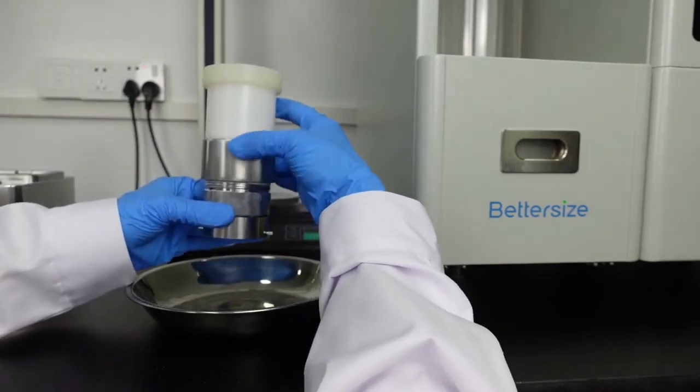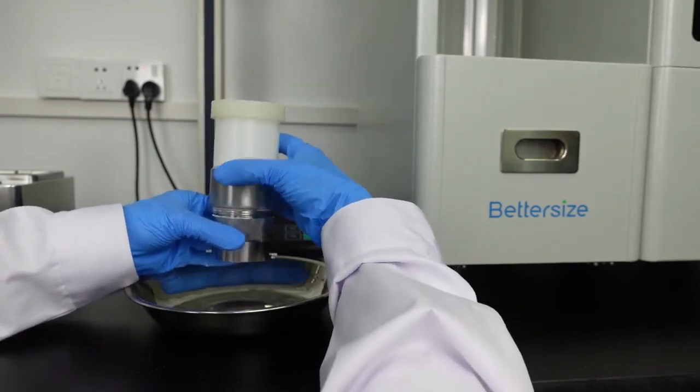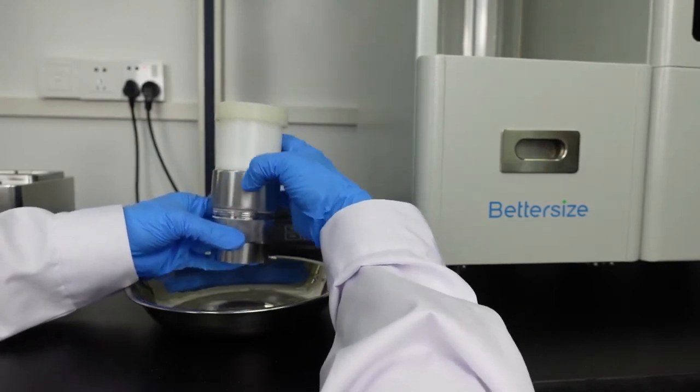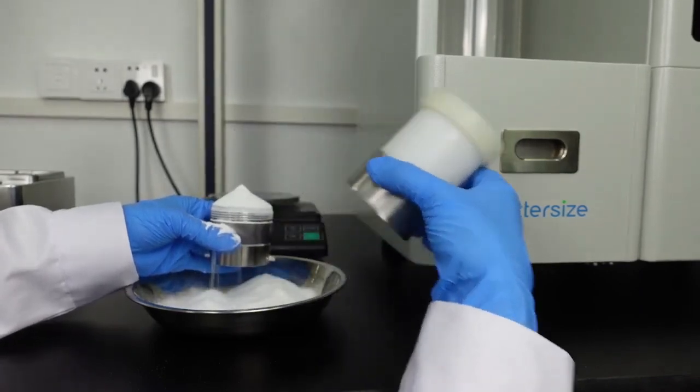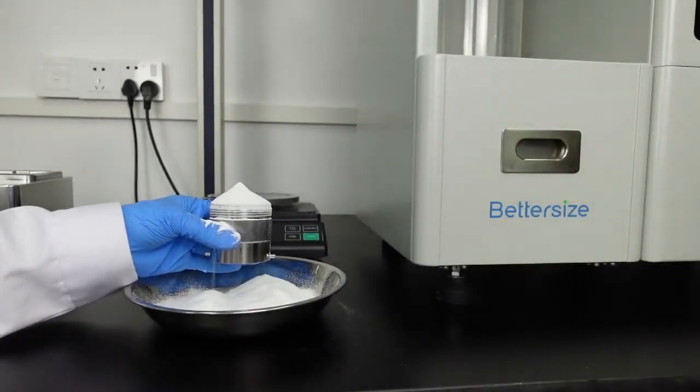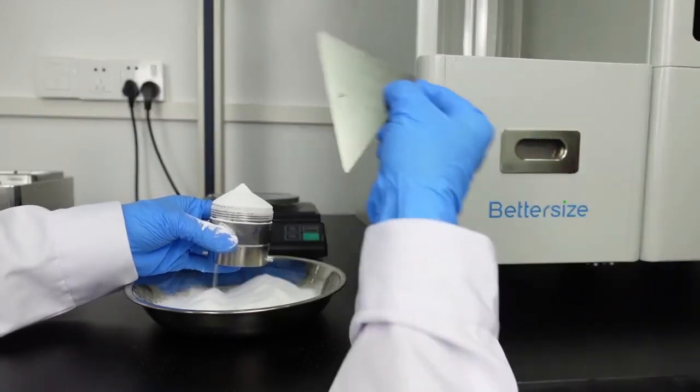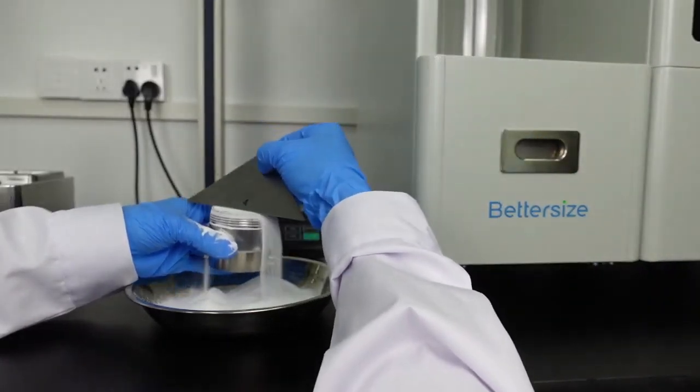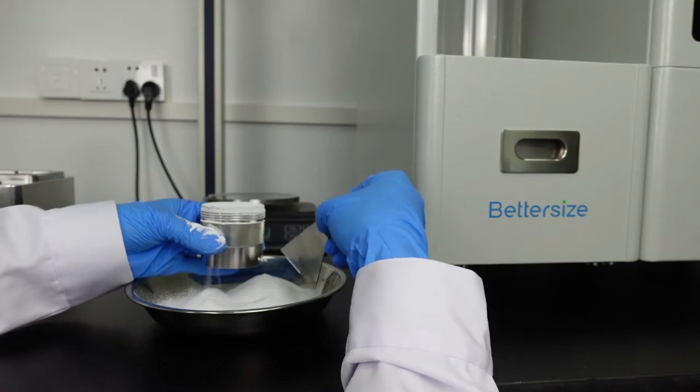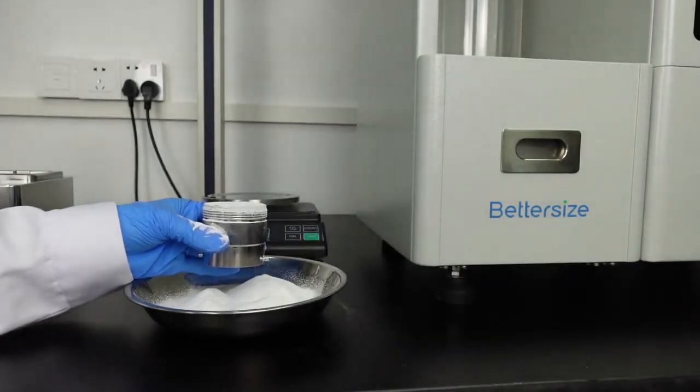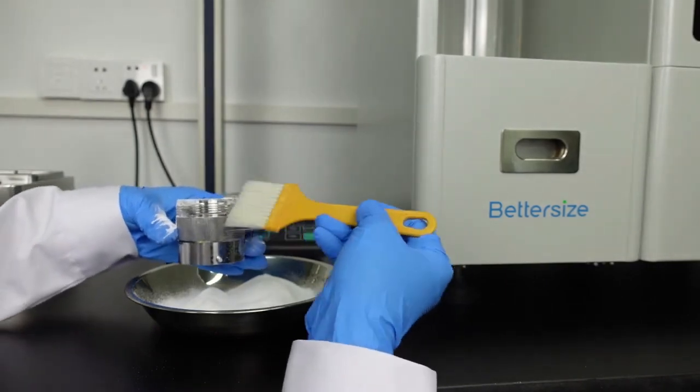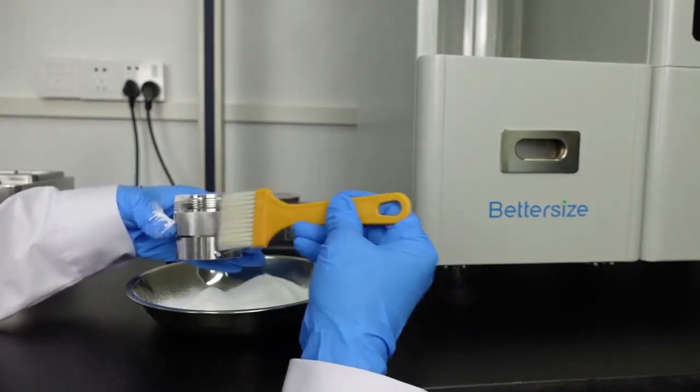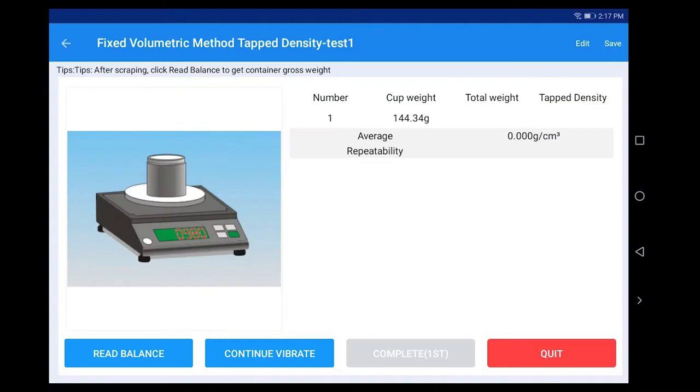Separate the 100ml container from the extension tube. Scrape excess sample from the top of the 100ml container with a scraper, and gently sweep the powder adhered to the outer wall of the container with a brush, and place it on the balance.